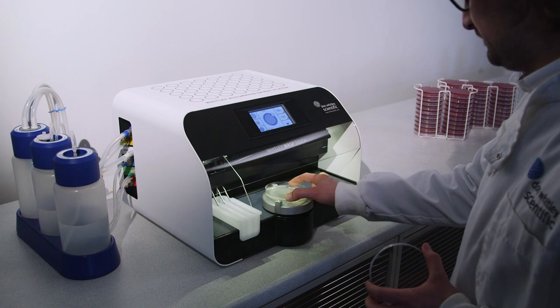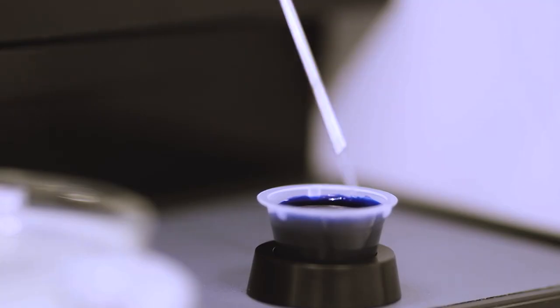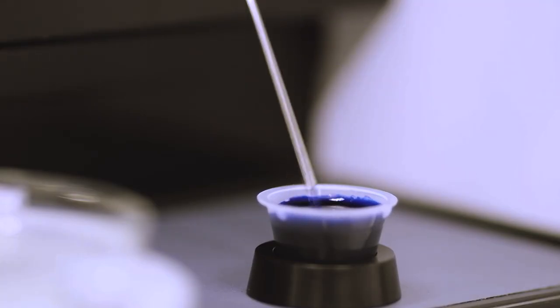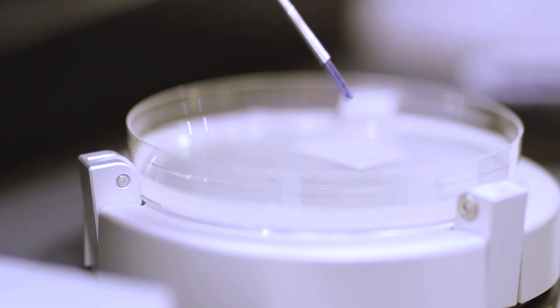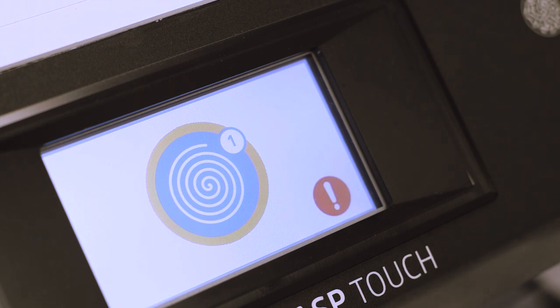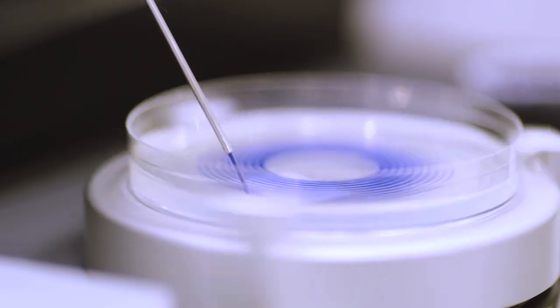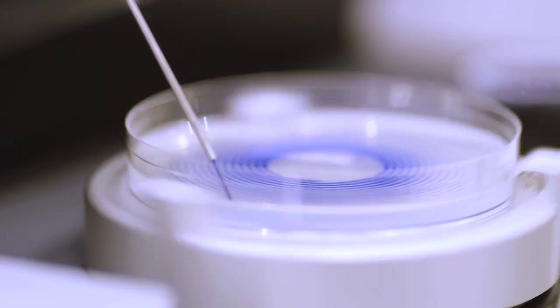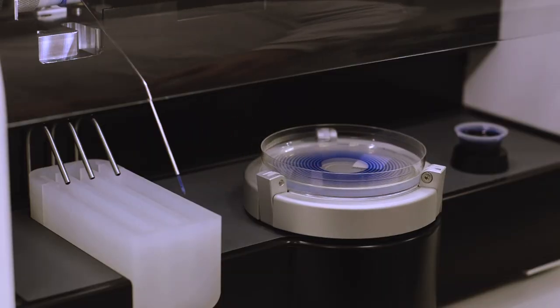Don Whitley Scientific introduced spiral plating to the UK in 1978 and from there developed the Whitley Automated Spiral Plater, which has been an international success. Our 40 years of experience with this technique have allowed us to create the next generation of innovative and efficient spiral plater.